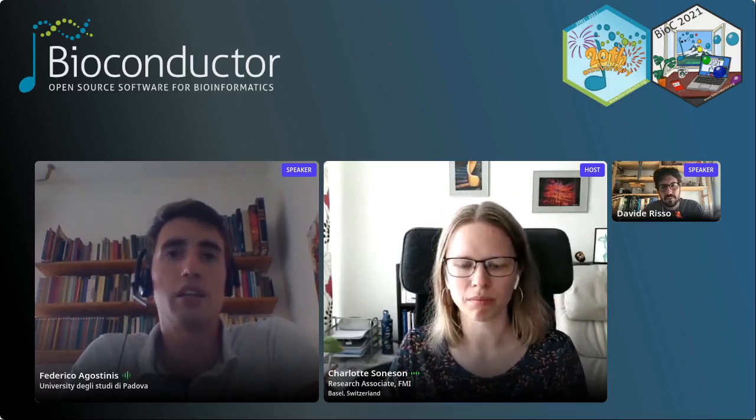And if you are undecided between some numbers, just estimate different models and compare the results using AIC and BIC. The only comparison that I have done, but is not here and is also not in the application note, is between 2 and 10 components. Yes, there is a big difference, and so 10 is a general number, and I often use that.